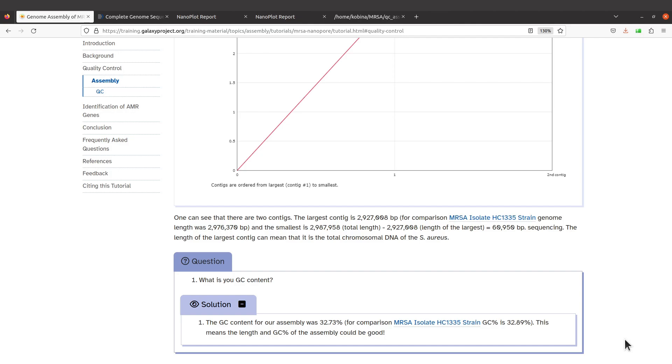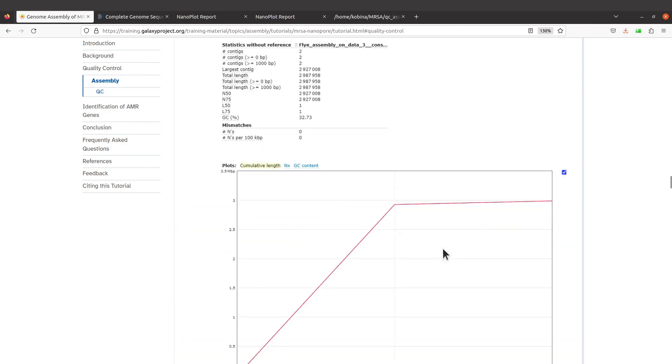These are things you always have to do. The largest contig here has this one, so this could mean that the contig is the total chromosomal DNA of the isolate S. aureus, and so linking that to ours, we also have this.